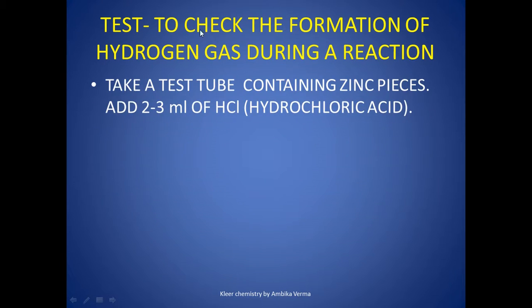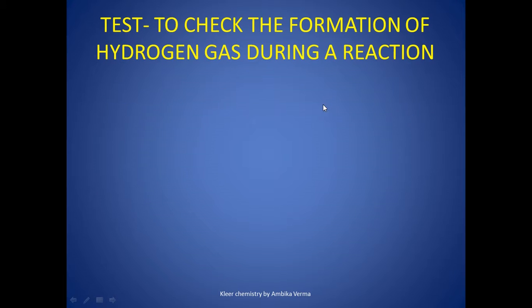So what are the steps? First, take a test tube containing zinc pieces, which is a metal, and add 2–3 ml of hydrochloric acid, which is a laboratory acid. We will take zinc in a test tube and pour hydrochloric acid into it.